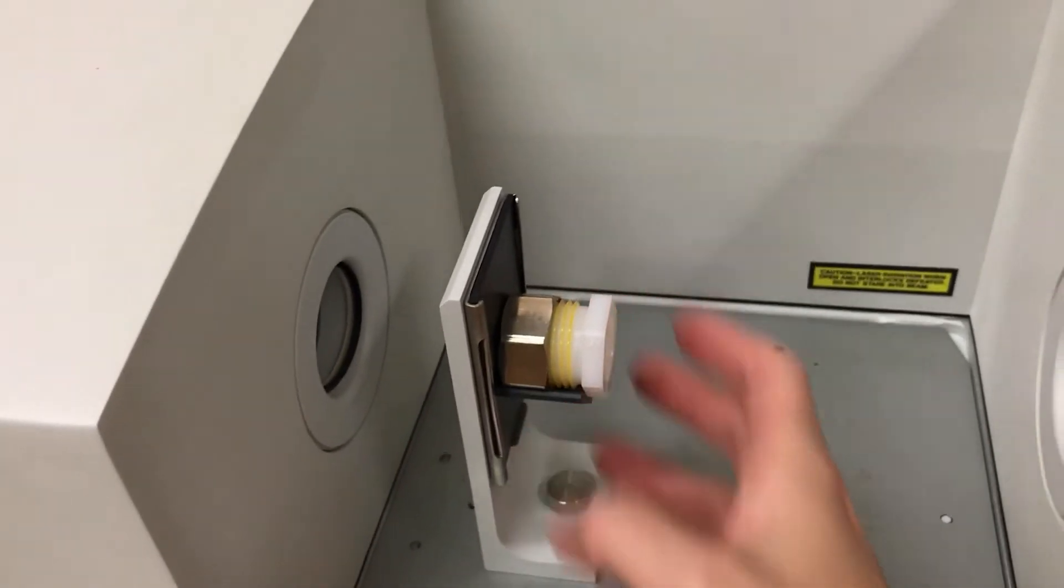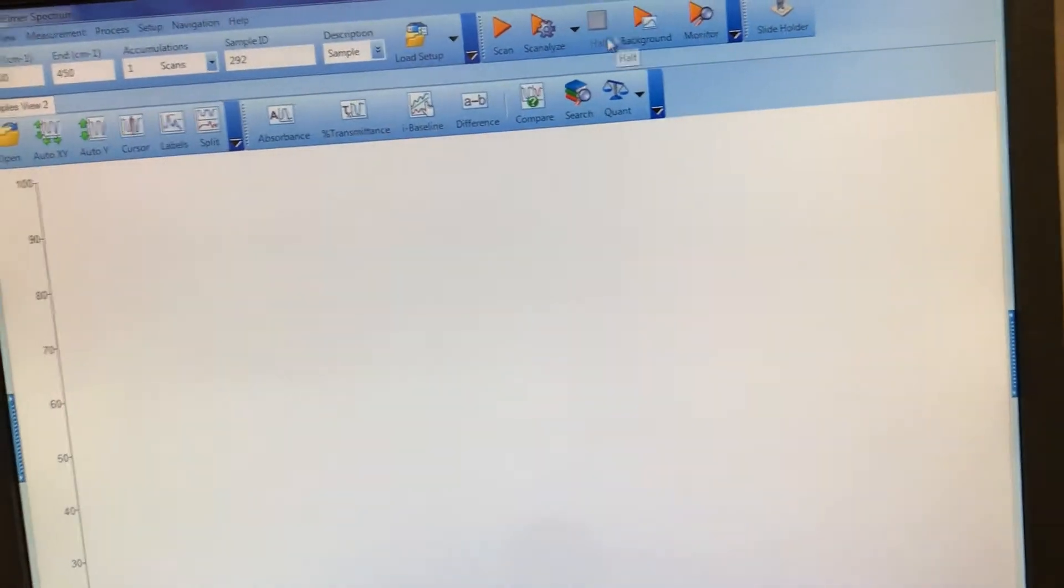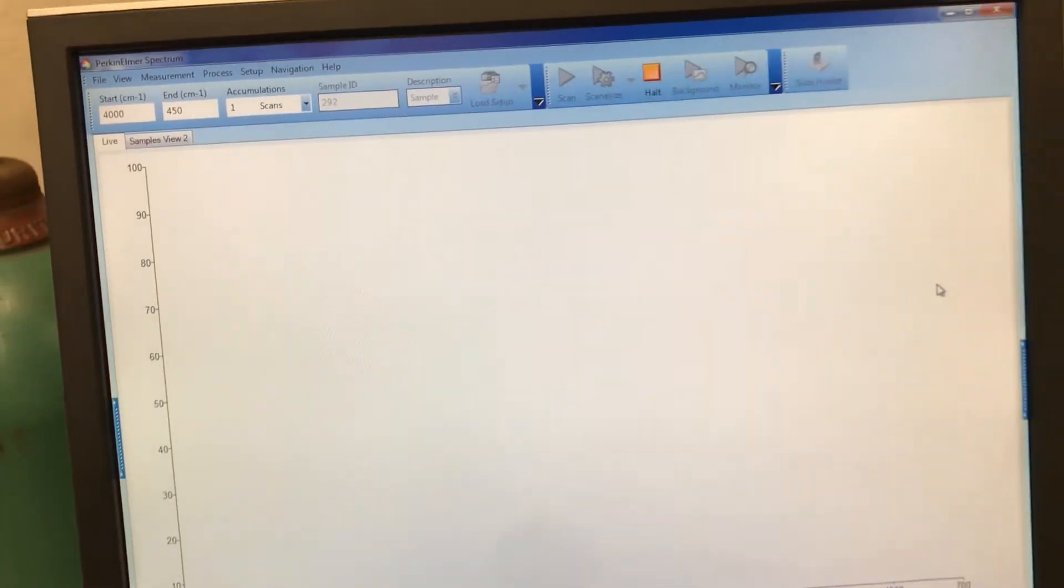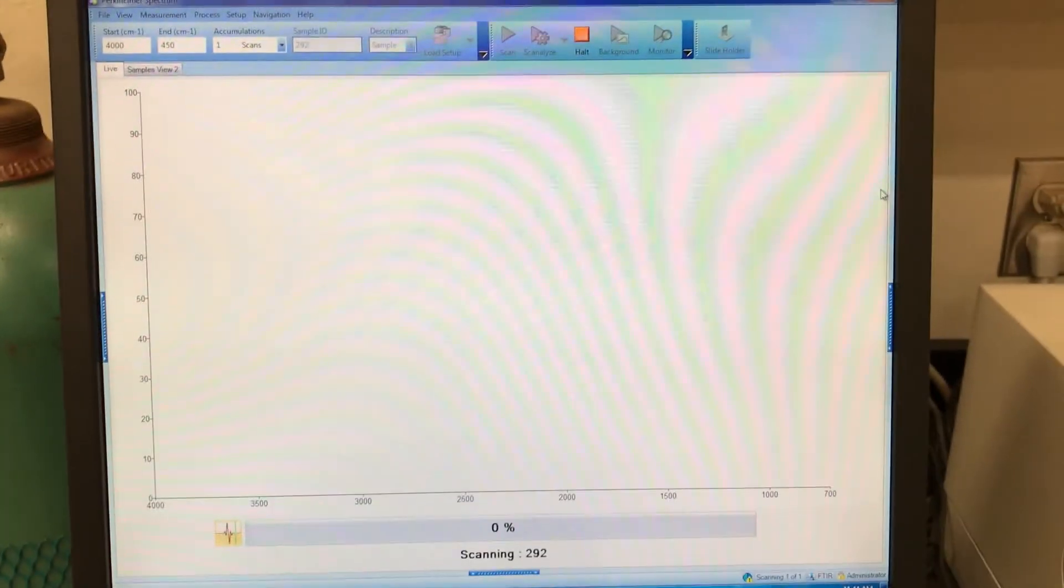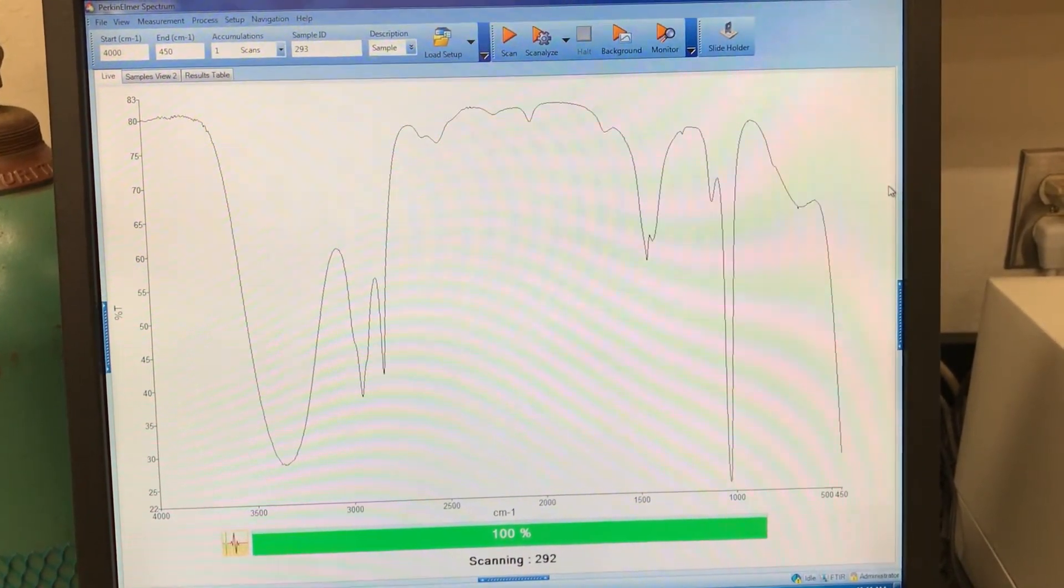IR is going to be sent through the instrument through the air and through your sample and so then you go to the computer and push scan and by having that background saved the computer will subtract the two spectra which means that what it shows you is only the absorbances from your sample not from the air.